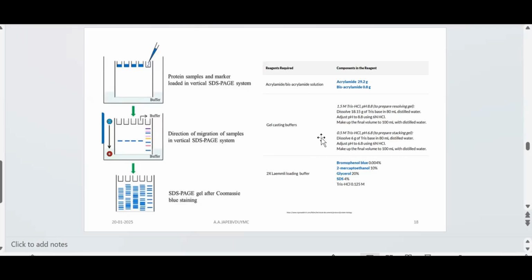Here, buffer is shown, but before that, the buffer reservoir is there, through which it is going to be put into the electrophoretic system. And another is the power supply. So, these are the two things. So buffer reservoir has upper and lower buffer reservoir connectors there, and they are connected by gel. So at one end you have a buffer reservoir, at another end you have a buffer reservoir, in between you have the gel. So platinum electrodes are there, which are going to be the power supply providers. Current will be conducted through those.